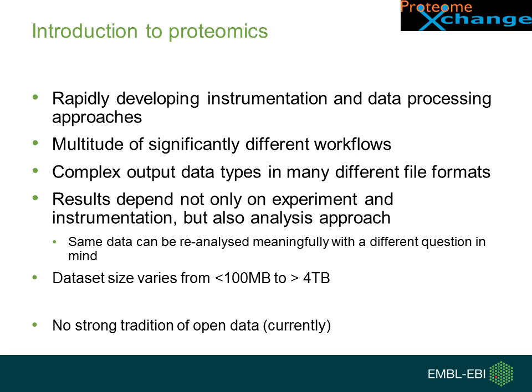An important point is the results of an experiment depend not only on the actual experimental setup and instrumentation, but also very significantly on the analysis approach. And that means that the same data can be meaningfully reanalyzed with a different question in mind.